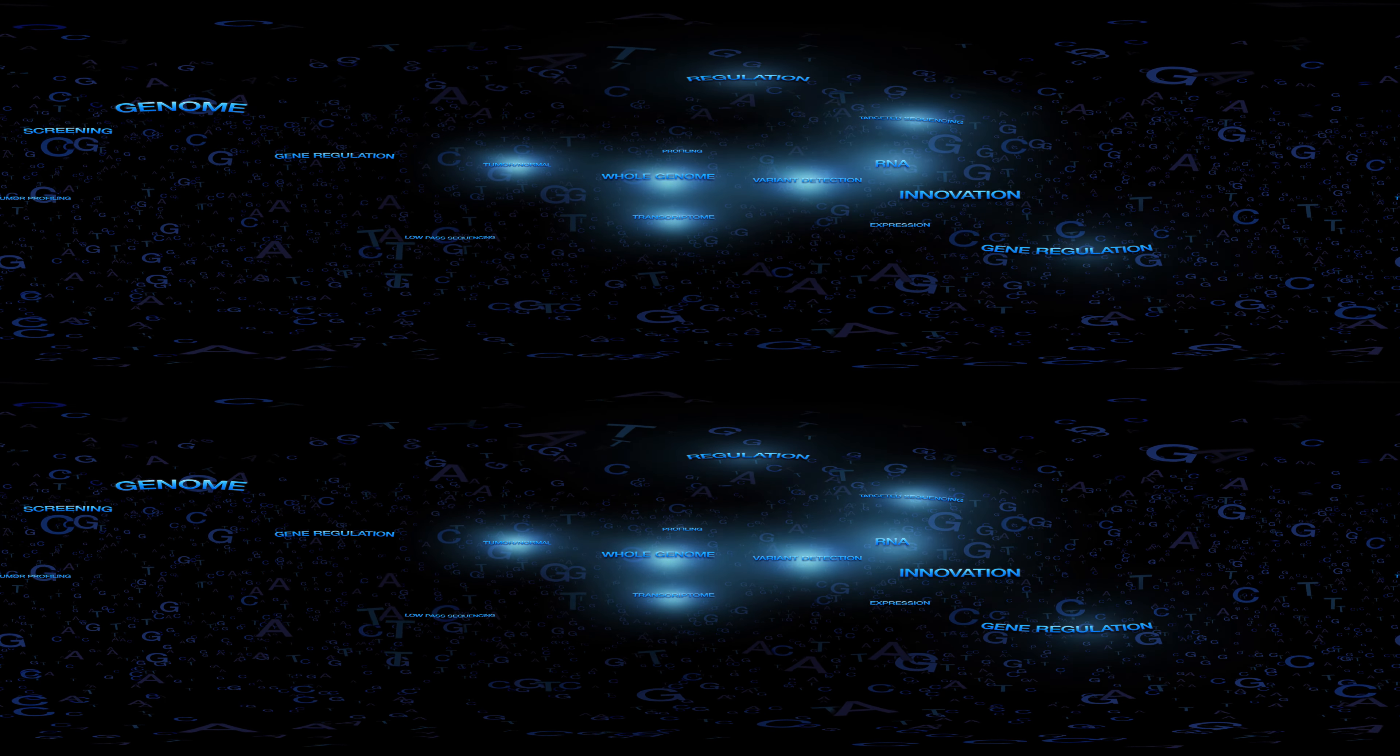With the flexibility for virtually any method, species and scale, from tumor profiling to digital gene expression, you can redefine what's possible in sequencing.